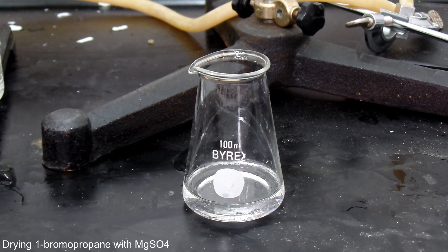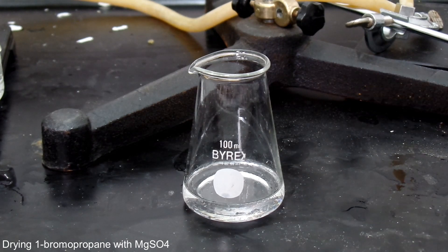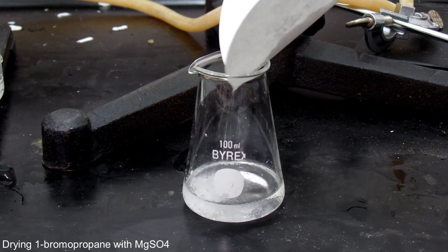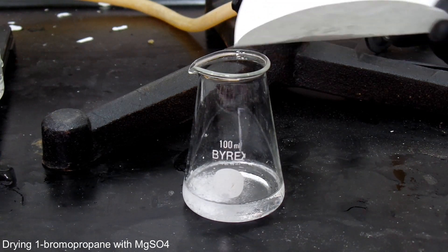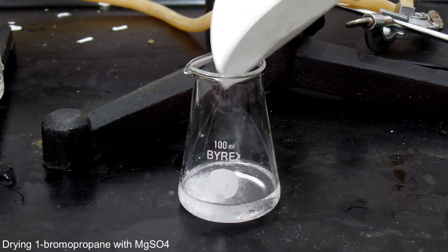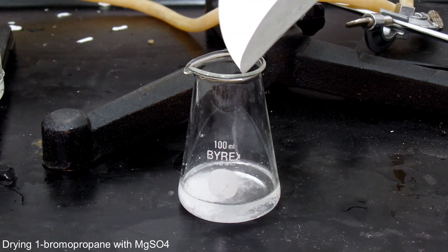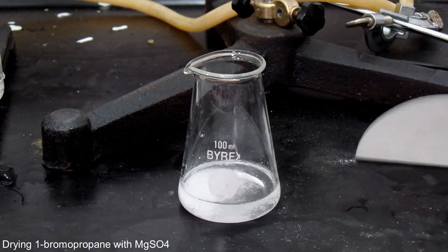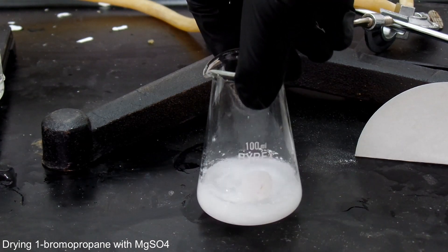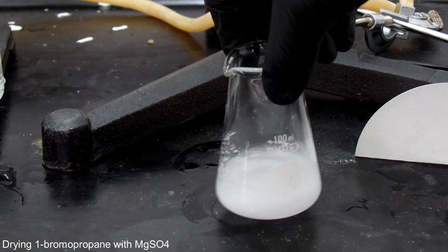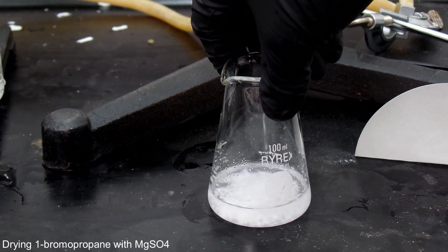Before we start, there are some requirements for smooth reaction. You should dry all your solvent or reagents that will be used for the reaction. Grignard reagents will be destroyed by water. And you might be thinking, does drying the liquid mean evaporating that liquid? You're right, but for organic chemistry where you use tons of organic non-polar solvents, drying means to get rid of water from that solvent.